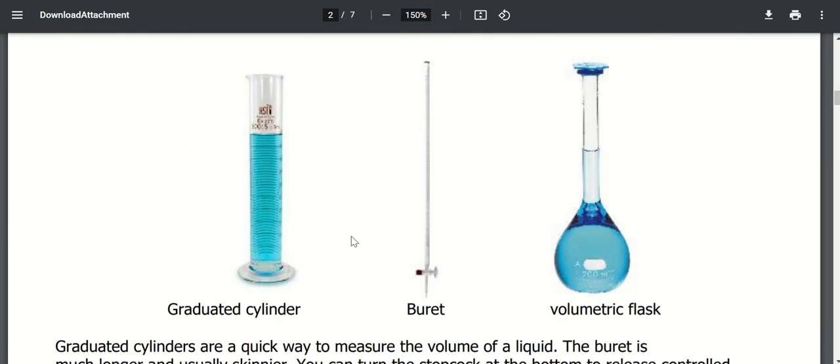And then here is a diagram showing you the different types of glassware where you can measure volume. Now, this isn't just measuring density straight away. This is measuring the volume portion of it. And based off of lab 1, we learned how we can measure mass with scales, the triple beam balance and electronic analytical scales, which you completed. And then for volume, we learned about graduated cylinders and also burettes. So this is kind of reviewing that.